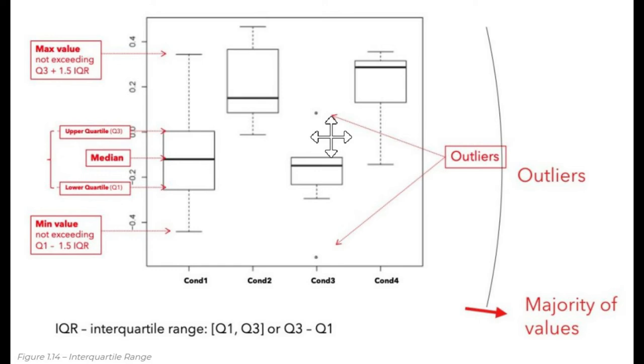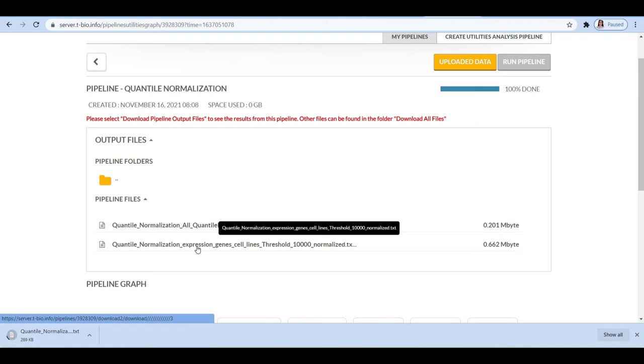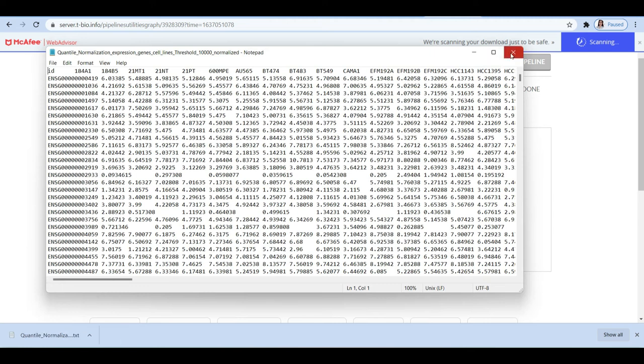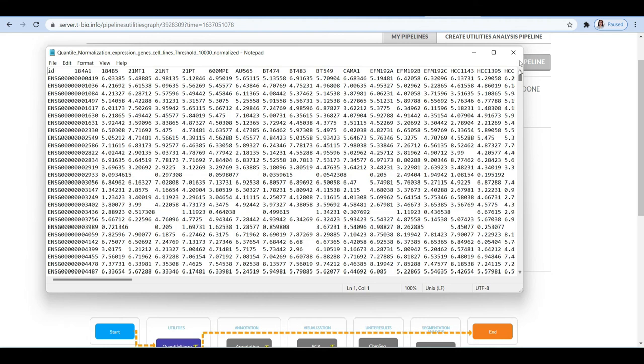You can prepare the box plots in Excel to see how it can show us a comparison between FPKM output and normalized data. The first figure shows the majority of values that is not seen at all because there is a gap between the majority low levels and some outlier high values in the selected samples. After normalization, this gap disappears, placing most of the data into a more easily distinguishable scale. In fact, it shows the variance of data that is needed for a comprehensive comparison.